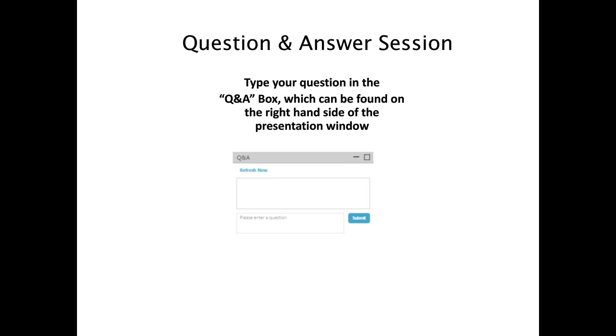Next question is, you mentioned gradient steepness should be evaluated for method development. Is there a criteria? And then also, how should we determine whether it is acceptable? Well, when I say gradient steepness should be evaluated, if you were working with computer simulation by running a gradient that differs from another gradient by a factor of 3, then you use those as inputs, and you can then see what the impact of gradient slope or steepness is on the resolution and separation.